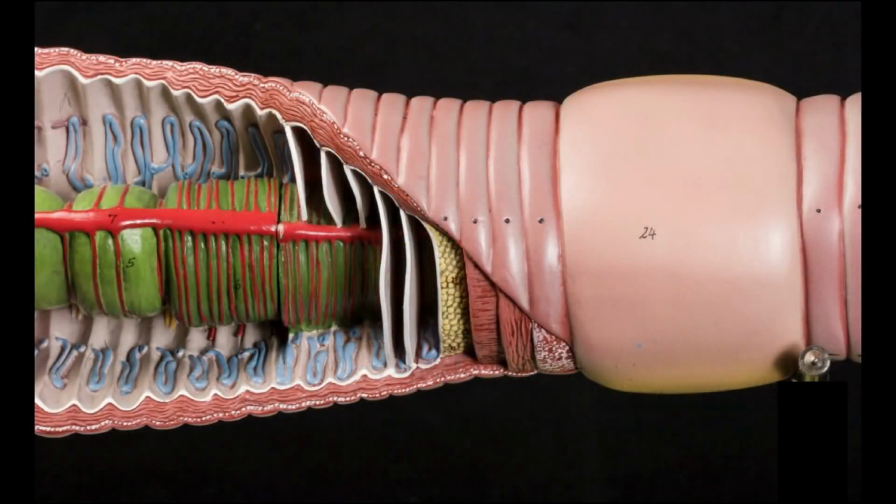Now let's look at the model again from a different perspective. Notice once again the metanephridia. As I said before, there are 2 in each body segment.